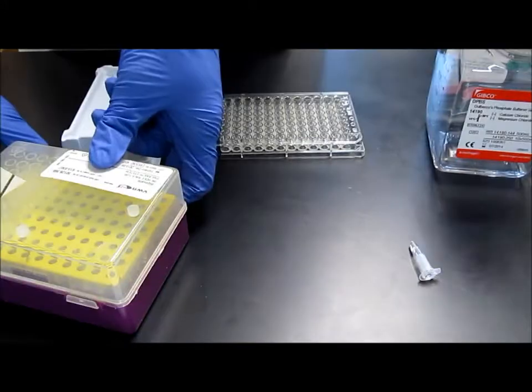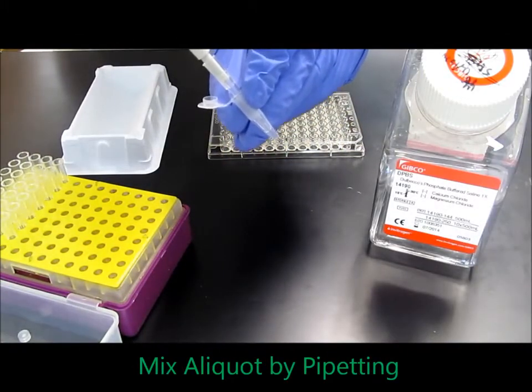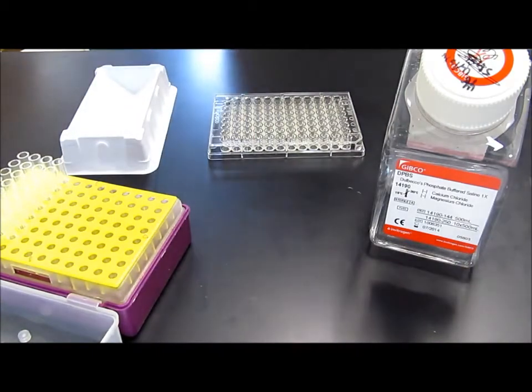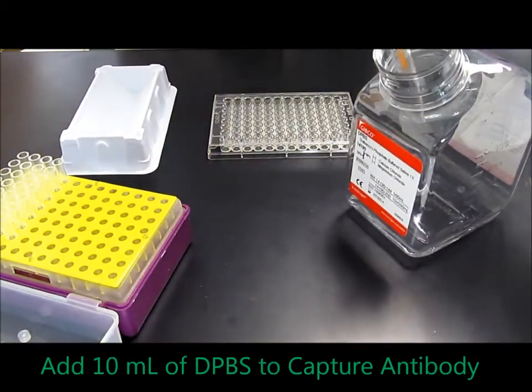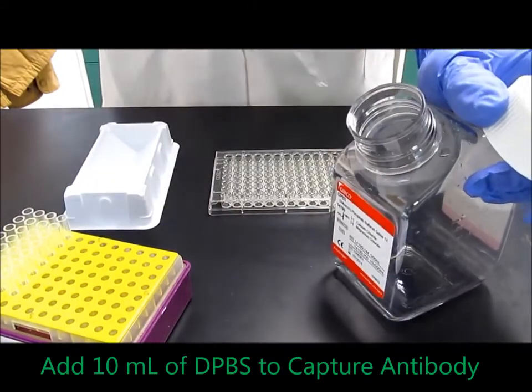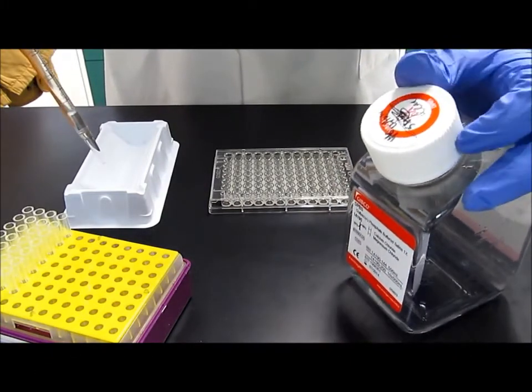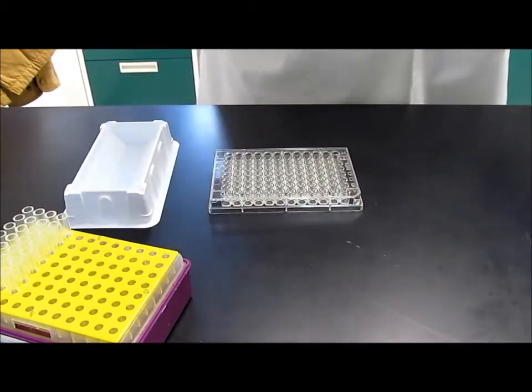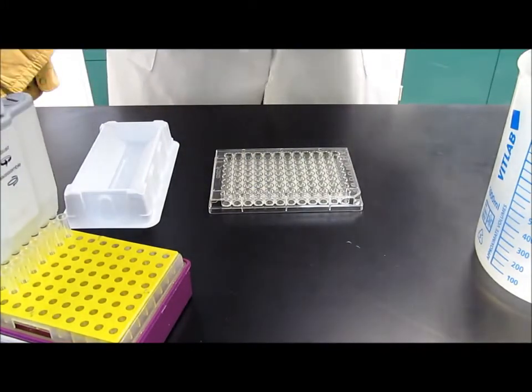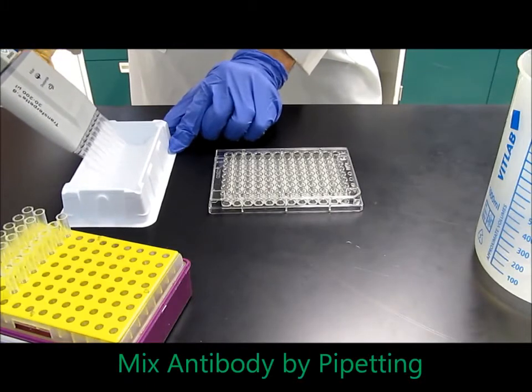What you're going to do first is, using your pipetter, mix the capture antibody aliquot a few times to make sure that the antibody is distributed, and then place the droplet onto the empty reservoir. For the next step, you're going to add 10 milliliters of DPBS to the reagent reservoir, and it's important to note that you dilute capture antibody in DPBS because you're trying to maximize binding to the ELISA plate. Now, after you've diluted the capture antibody in PBS, set your micropipetter to 100 microliters and pipette back and forth to mix the capture antibody thoroughly.